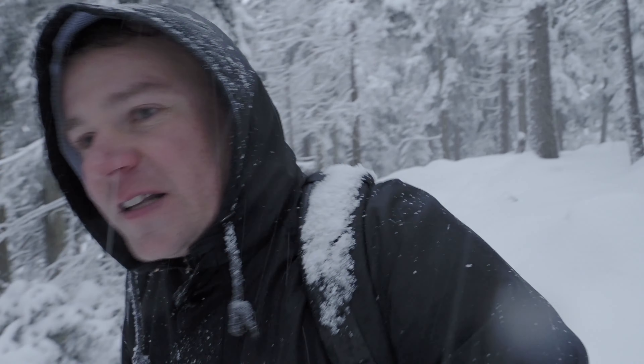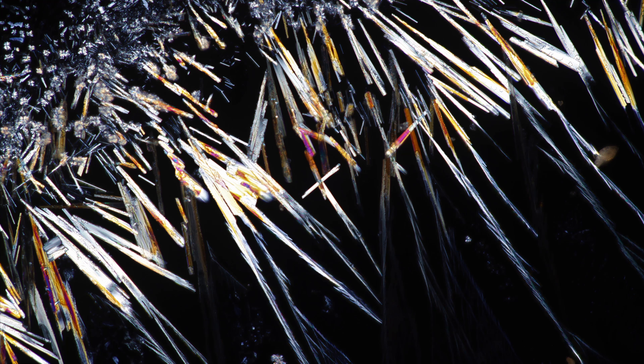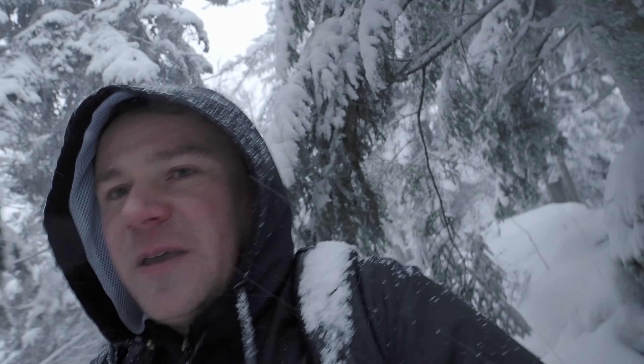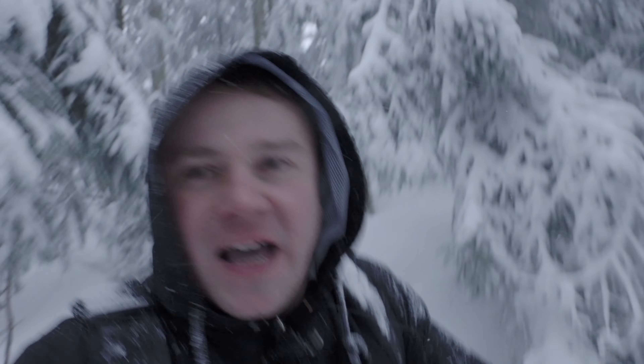Furthermore, you can use this extraction method also with all other types of lichens — you will be surprised what kind of results you get. But my favorite is the gold dust lichen. The crystals it yields are just superior to all crystals from all other lichens that I've seen until now. These crystals are absolutely beautiful to watch, and they open a window into a world that is often hidden when you do simple microscopic observations, just by slicing it into thin layers.